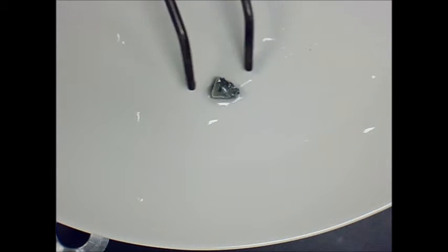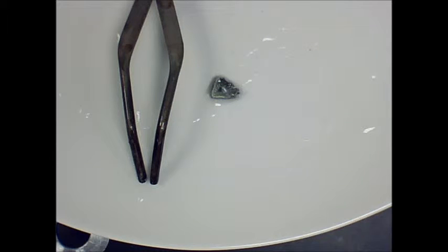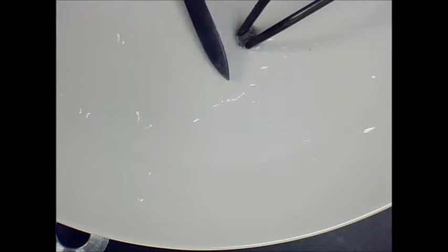And you can see that coating is sort of grayish, not so white like the last one. We'll cut it open and see what the inside looks like again. But that's an oxidized coating, so it's oxygen combined with potassium. See how soft it is?